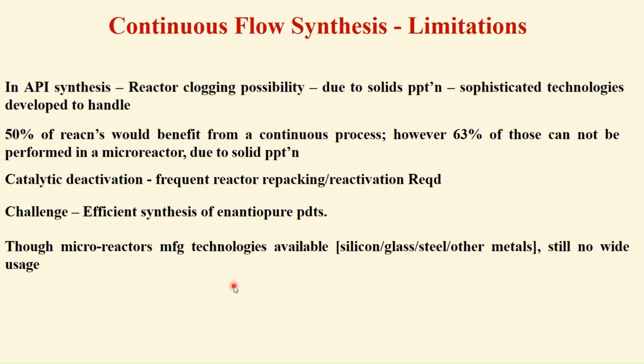Though microreactors can be manufactured and technologies have been developed, silicon microreactors, glass microreactors, steel microreactors, or Teflon microreactors have been produced, but still we are at the nascent stage. There's a very long way to go.